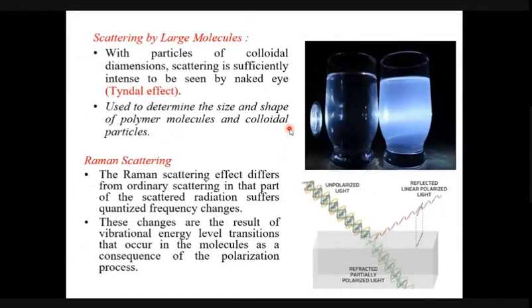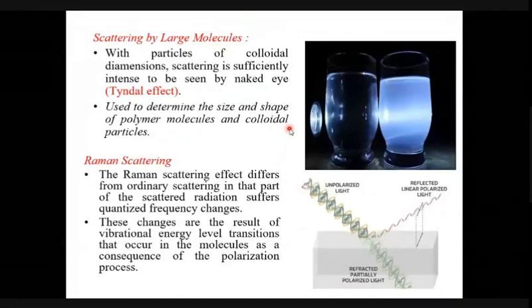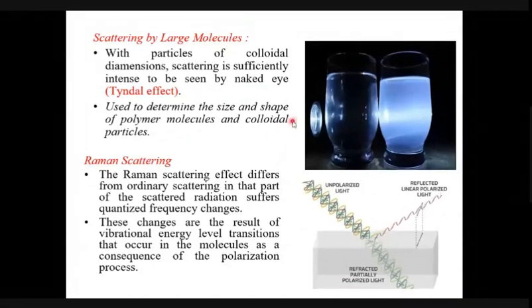So that is called the Tyndall effect. Again, a scattering effect. Now, this is used to determine the size and shape of polymer molecules and colloidal particles. I guess you have done this in physical pharmacy practicals.